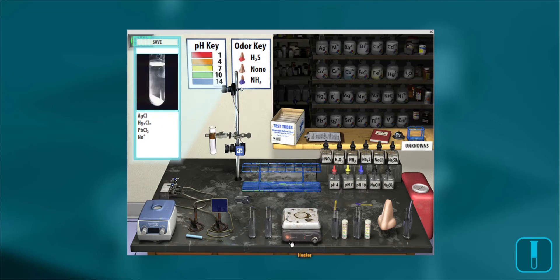We centrifuge it, then heat it, and then decant off. Based on the color, we see there is an insoluble substance at room temperature but not when heated, which helps identify lead.